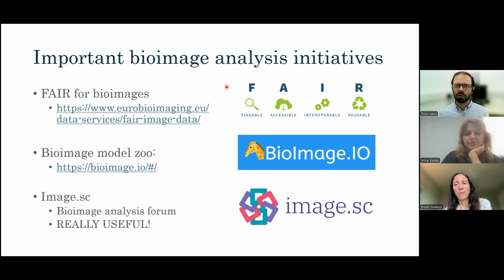But definitely for volume EM compared to, say, cryo tomography, the scale's completely different. So that's one of the reasons. People do cryo tomography just because they're looking at stuff that's on the nanoscale, whereas for volume EM, you're looking at things on the kind of cellular scale. You're going to be able to capture much larger volumes of tissue much easier than you would for cryo. Even something like cryo FibSem, where you're still doing volume EM, but on a frozen sample, you're going to be able to only really image a small region of your tissue.